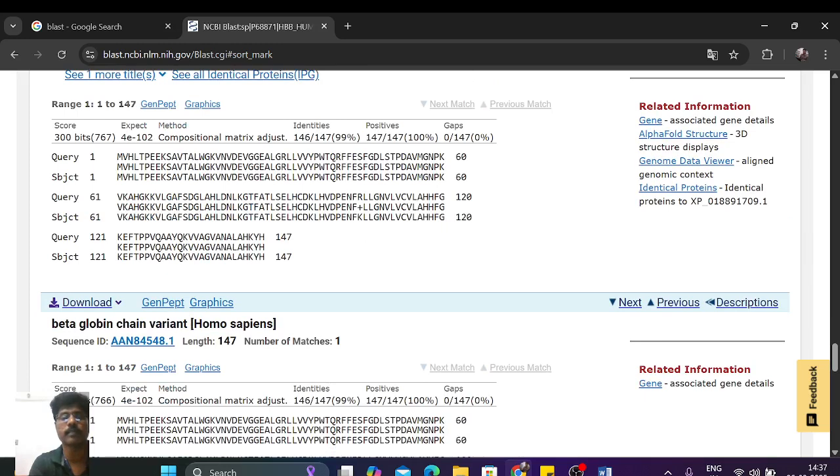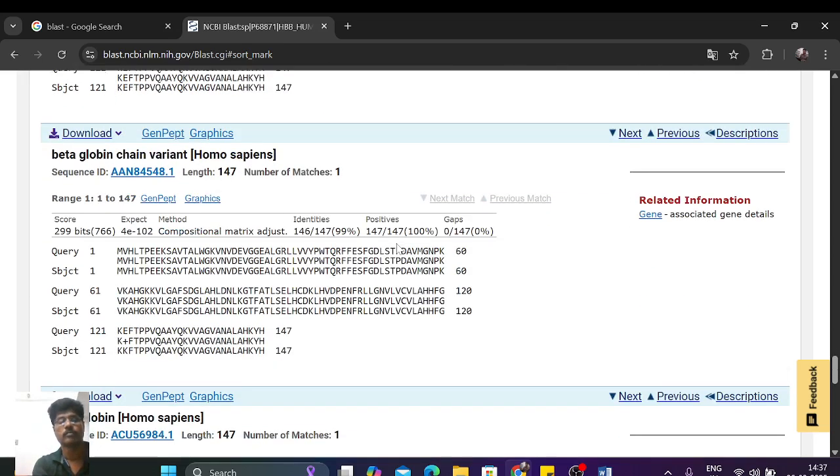identified. See that there is a plus symbol in between. That plus symbol means polar amino acids replace polar amino acids. Otherwise, non-polar amino acids get replaced with non-polar amino acids, which means there are not that many functional differences between the proteins. Okay, so sometimes you may get a slash, sometimes you may get a hyphen, sometimes you may get colon structures in that. You should know what each denotes, respectively, right?